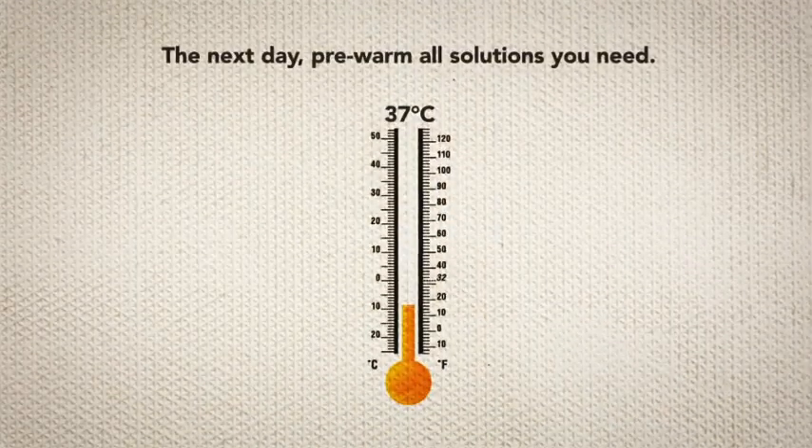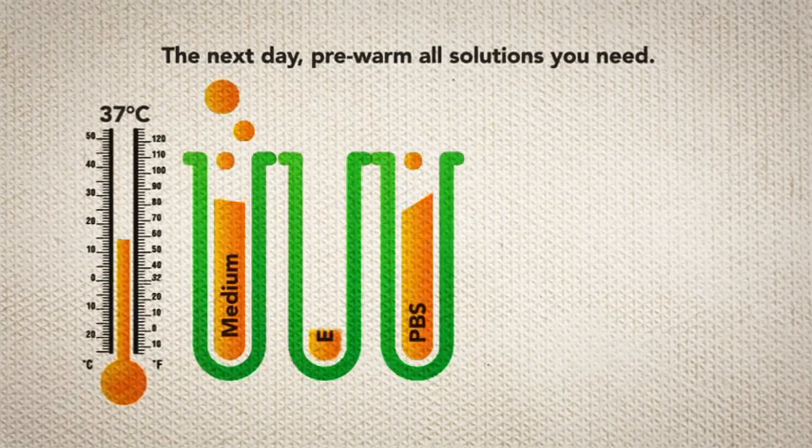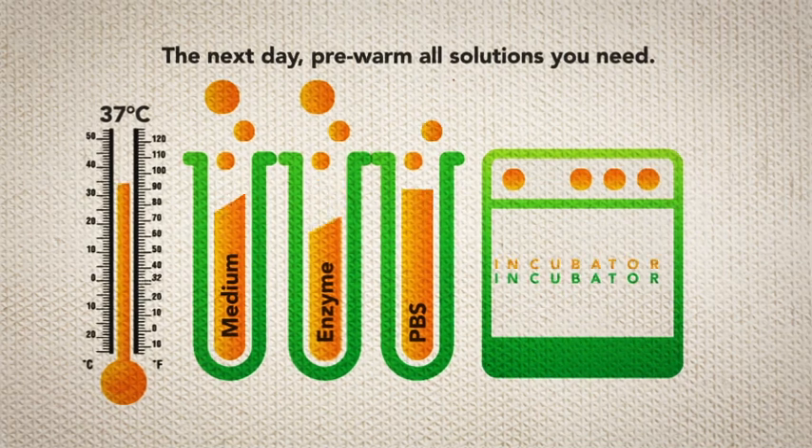The next day, pre-warm all solutions you need, such as medium, PBS, and enzyme. Also pre-warm your laminin plates by putting them in the incubator.